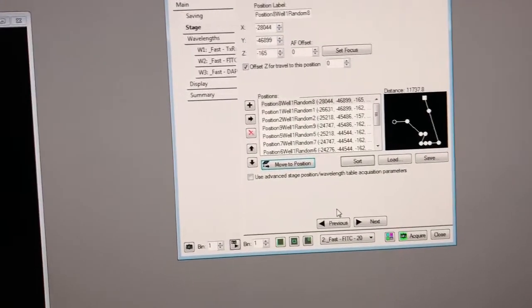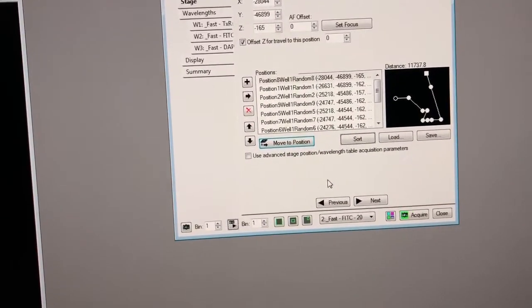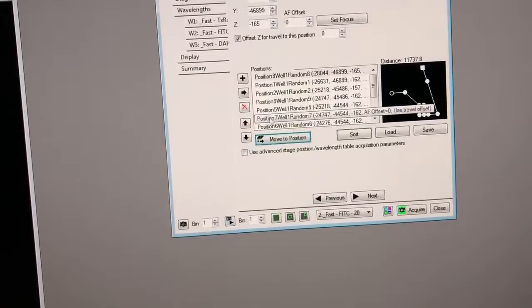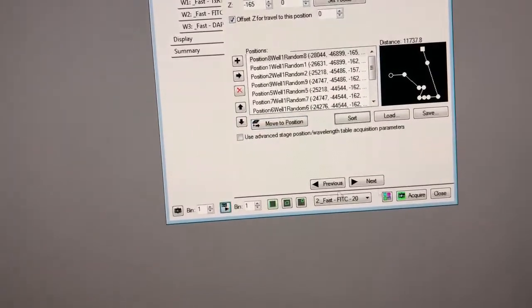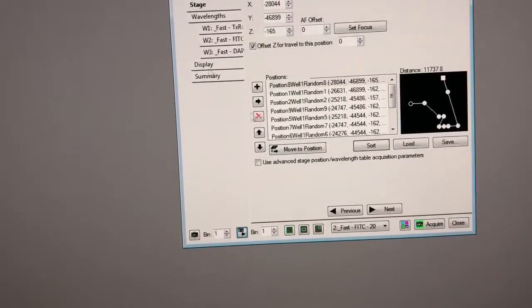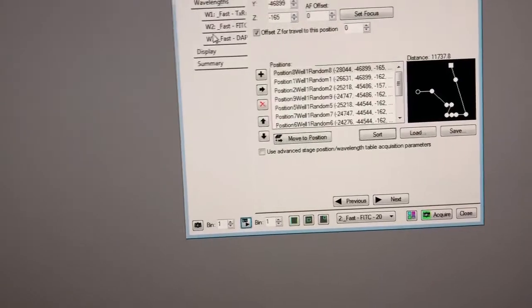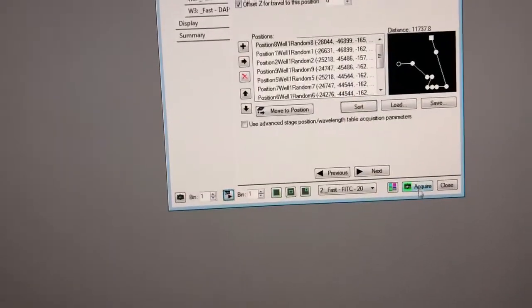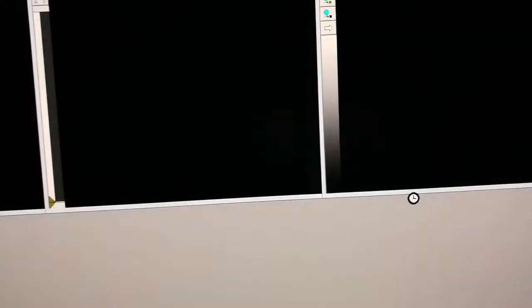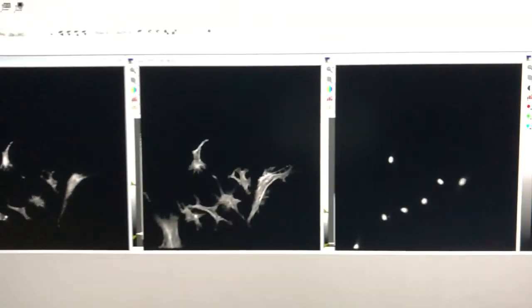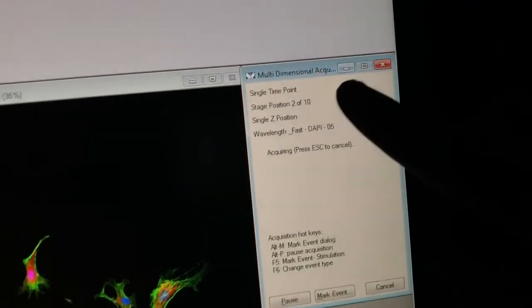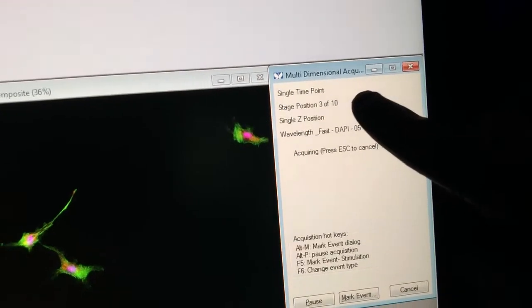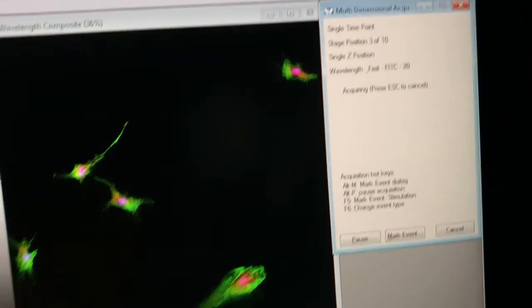So I'm not going to go to all the positions here. I'm just going to show you what happens next when you decide to acquire images. So once you've adjusted the focus on all of them then you can hit acquire and it'll take the three wavelengths at each position. So you can see three wavelengths that's position number one and here it tells you what it's on it's on stage position two then three it's taking these channels.